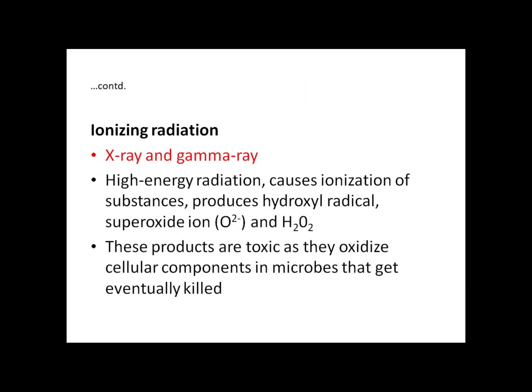We also have ionizing radiation like X-ray and gamma rays that can be used for sterilization. These are ionizing radiations because they are high energy radiation. They cause ionization of substances, producing hydroxyl radical, superoxide ion and hydrogen peroxide. And these products are toxic as they oxidize the cellular components in the microbes, which eventually get killed.